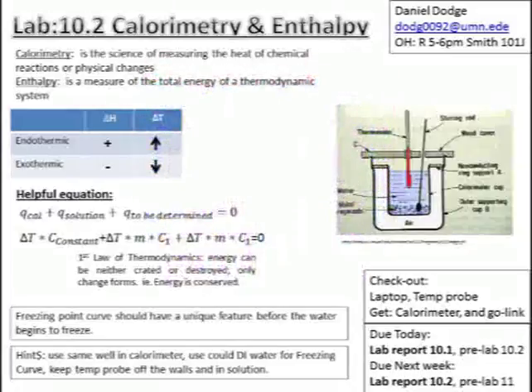In this lab, we're just kind of two parts. Part one is determining the enthalpy, or the change in heat, of the dissolution of your salt, because one of the key things in science that we want to know is, does it take energy to do something? Does something give off energy? And how much energy does it take in or give off? So to measure that, we use calorimetry.